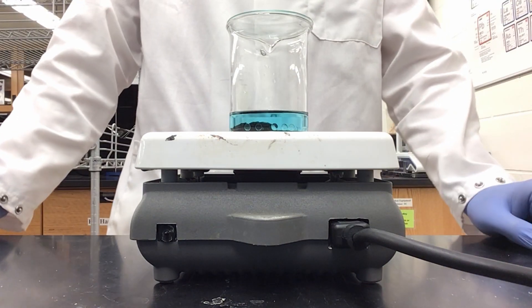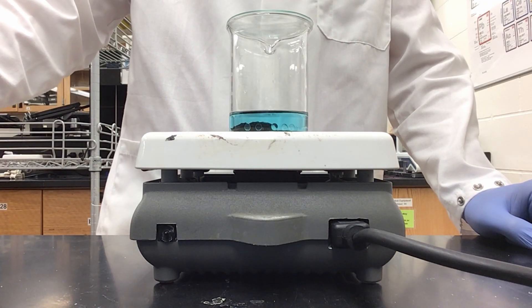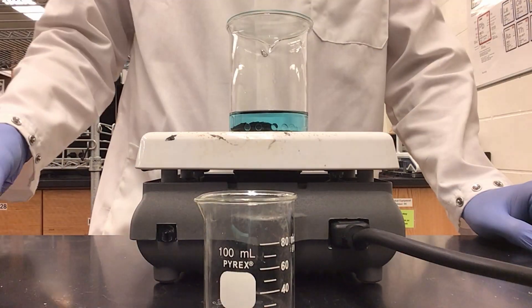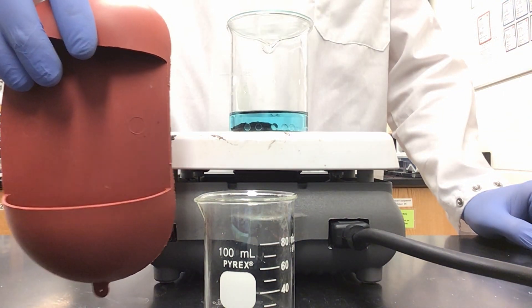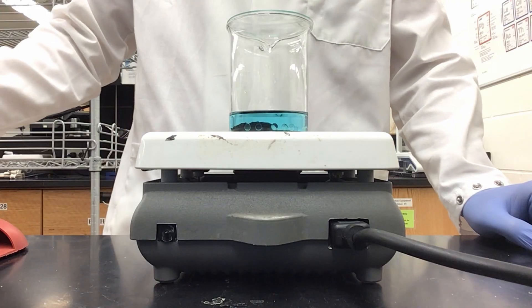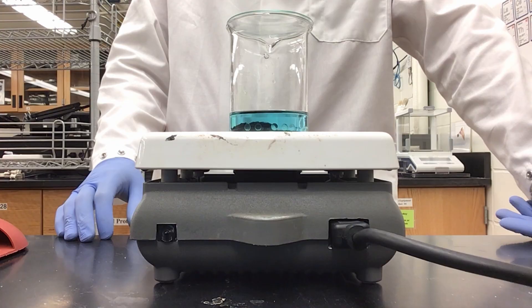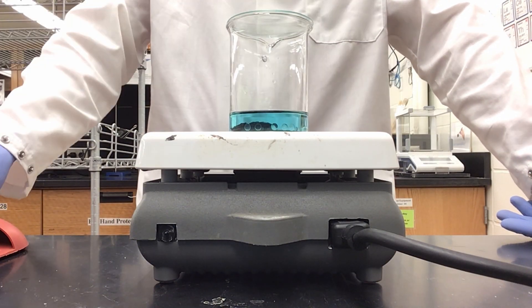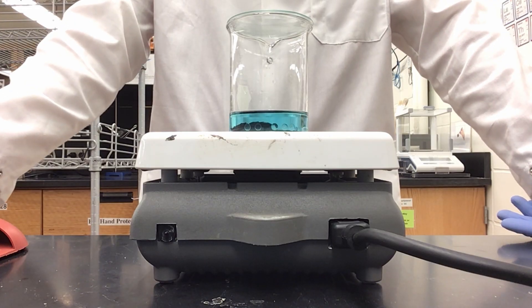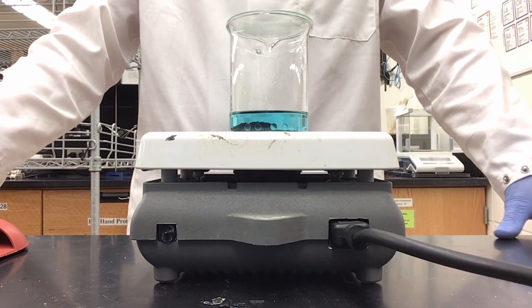As we wait for our solution to begin boiling, I can gather the next materials I am going to need: a 100 ml beaker, a glass stir rod, and a hot hand protector. Once our solution is homogenous, we will pour the solution down the stir rod into our 100 ml beaker in order to gather all of the solution in a smaller beaker so we can cool it and get it ready for filtration.